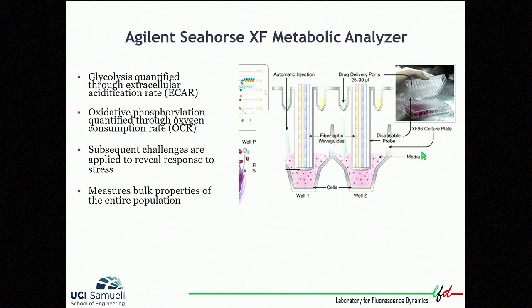We can actually monitor to see if the metabolic changes inferred with our FLIM imaging are in correlation with other types of techniques, including the Agilent Seahorse metabolic analyzer.